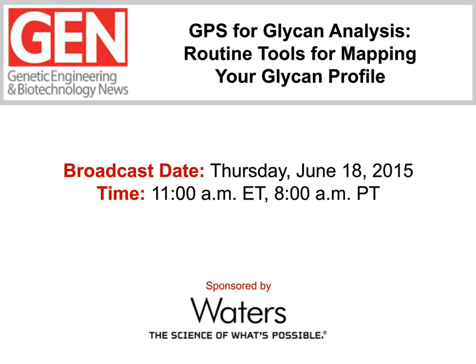Biopharmaceutical manufacturers are finding that the assessment of critical product quality attributes is increasingly a matter of evaluating post-translational modification. This is especially the case for glycosylation. But characterizing N-Glycan profiles has long proved difficult due to extensive labeling protocols and compromises in fluorescence and in the mass spectrometric sensitivities of different labels. Recently, however, a new technology has been introduced to address these challenges and to transform the N-Glycan profile analysis process. And that's what today's webinar is all about.